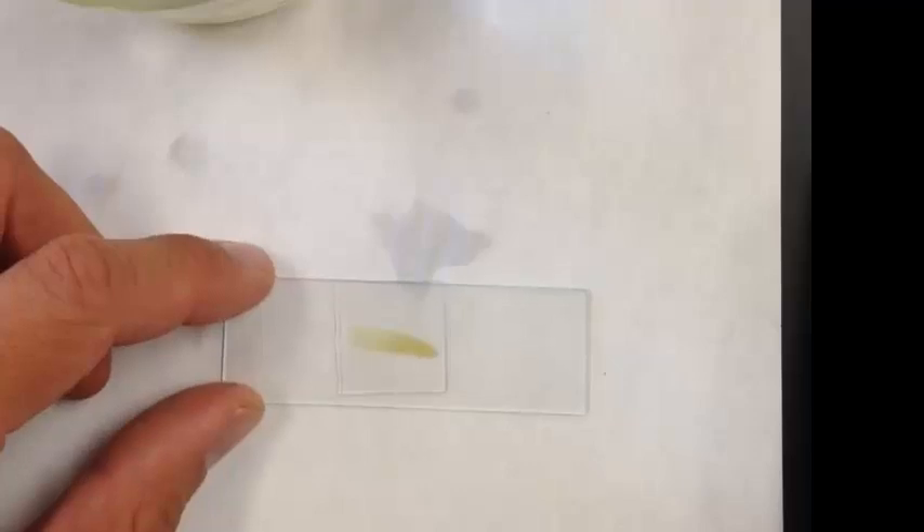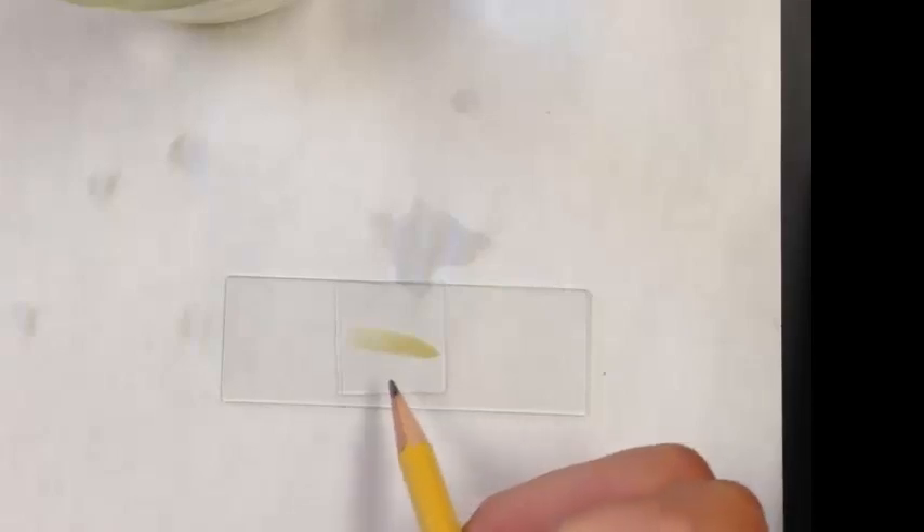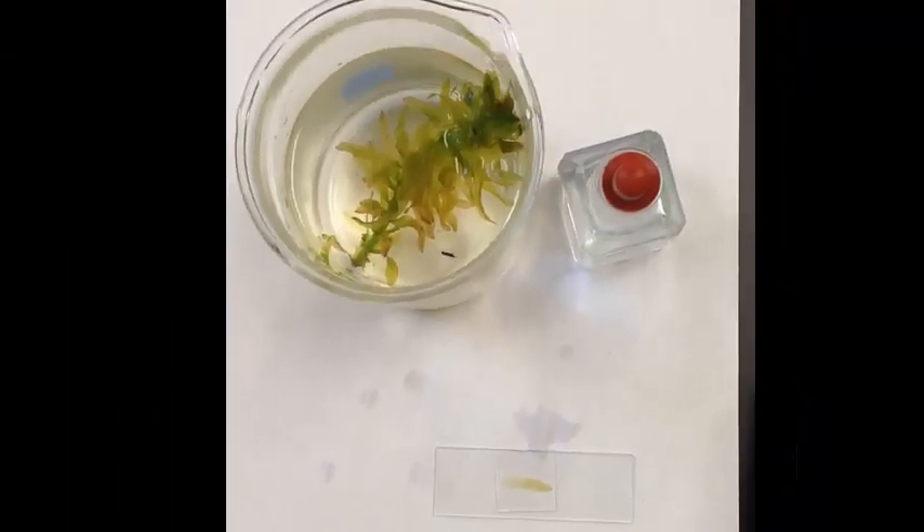And that's how you do a wet mount slide. We always want to make sure we don't have any air bubbles, or very few air bubbles, underneath the cover slip, because sometimes kids get confused with the air bubbles and think that they see something, but they're just looking at pockets of air. Boys and girls, that's how you do your wet mount slide. You'll need to know this for your photosynthesis lab. Thank you.